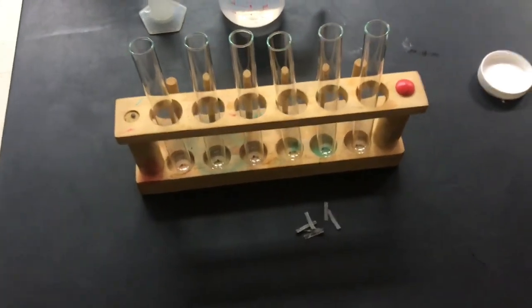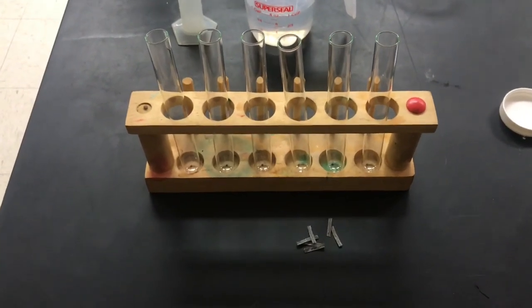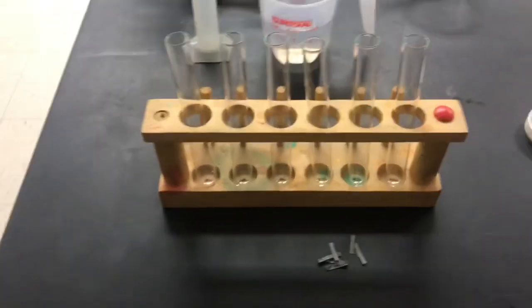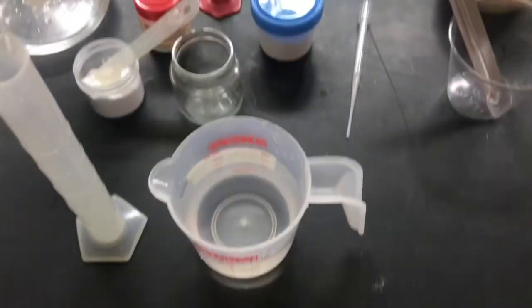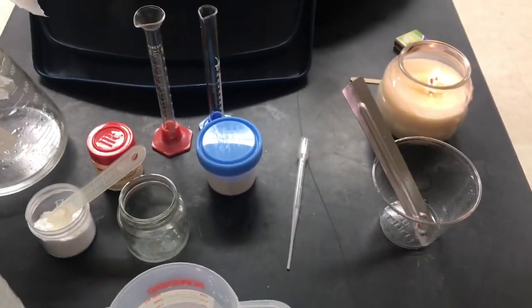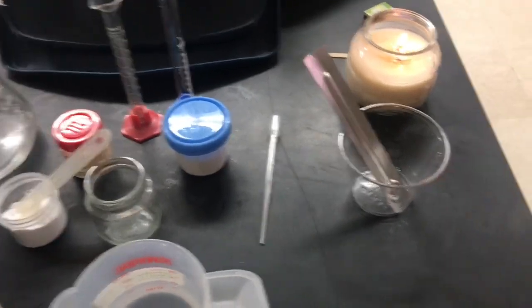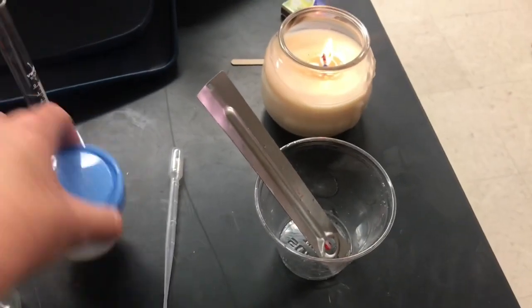This is our Chemical Changes Lab, the one that we did in three different parts. Here are my test tubes, my magnesium, my hydrochloric acid, my water, my baking soda, my cream of tartar, and my calcium chloride in this container with my little Dippin' Dots.